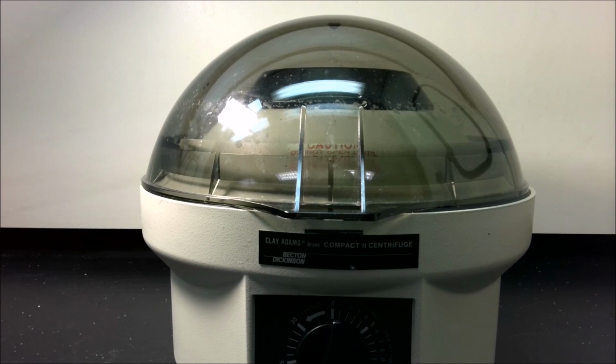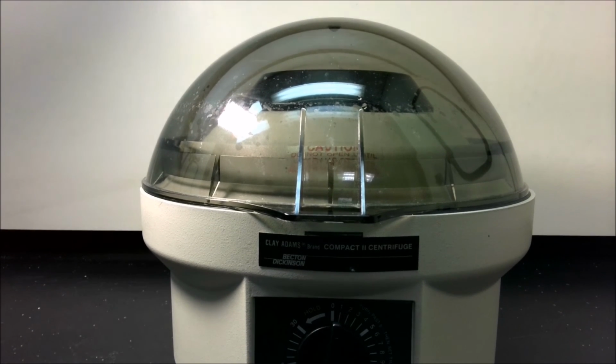Slowly come to a halt. It's important not to open the centrifuge and try to stop the rotor manually. This can damage the centrifuge. It could also result in your finger hitting the test tube sitting at the top, causing it to break, perhaps injuring you.